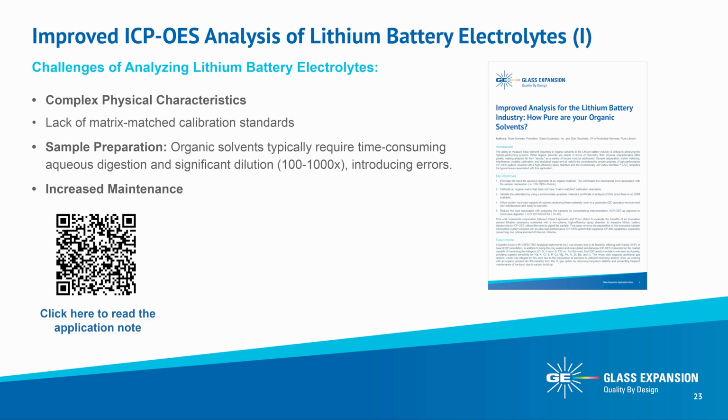To address these challenges, the next section highlights a recent application note developed with Pure Lithium, showcasing an innovative approach for analyzing lithium battery electrolytes in an IPA matrix.